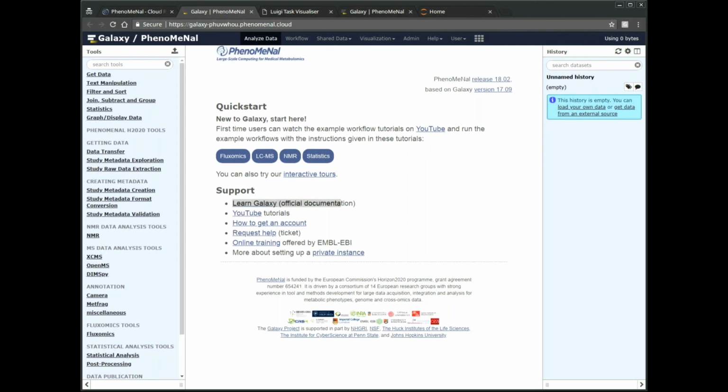How to analyze sensitive data in the cloud? Well, that kind of goes with what I was saying. You need to be careful about what you do with that. Some people that we know are using PhenoMeNal in a context where they're processing sensitive data. They have their own private cloud, in the sense that their institute has purchased a number of machines that they've installed in a secure network area where it cannot access the outside world.